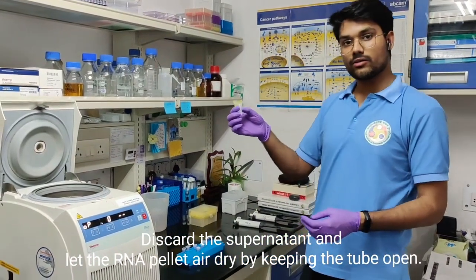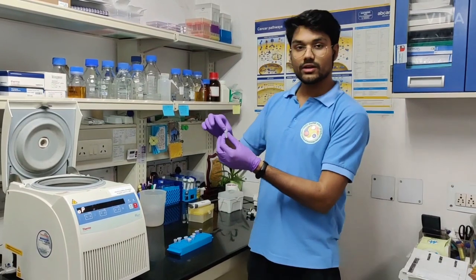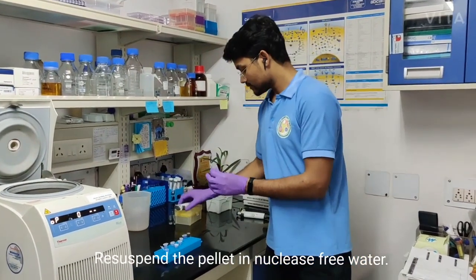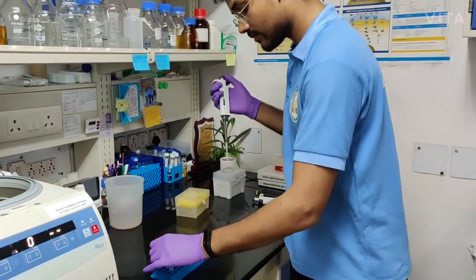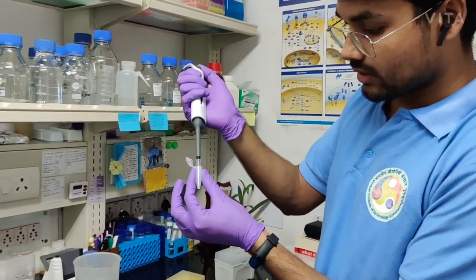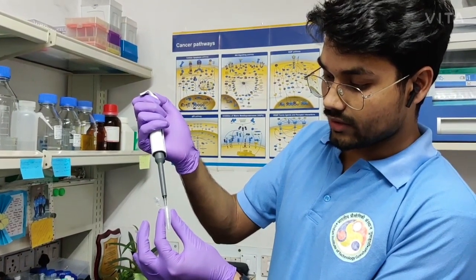Let the RNA pellet dry out and let the ethanol evaporate for 5-10 minutes. Now as you can see, this ethanol is completely evaporated. Now we will resuspend the RNA pellet in nuclease-free water. Here I am resuspending it in 20 microliters. I am mixing it with a pipette so that all this RNA gets diluted in this.